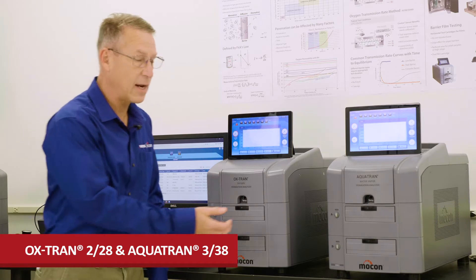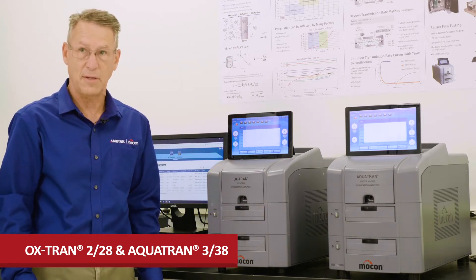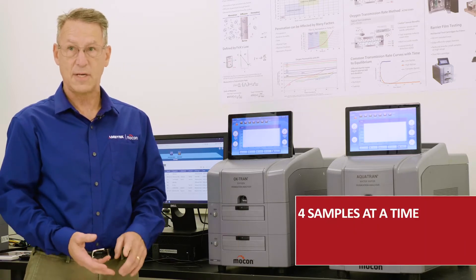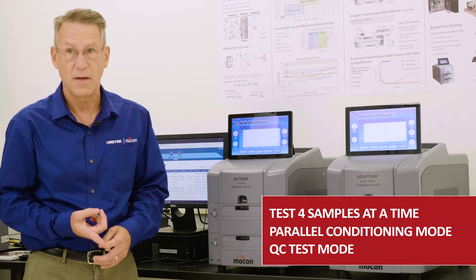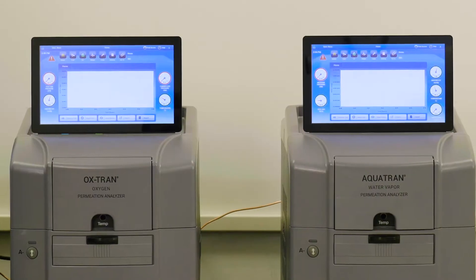MoCon's new Oxtran 228 and AquaTran 338 are designed for busy QC labs looking to upgrade their permeation testing capability while reducing their cost. The key features of these two instruments are the ability to test four samples at one time, a new parallel conditioning mode, as well as a new QC test mode that makes testing setup and reporting easier for the technicians.